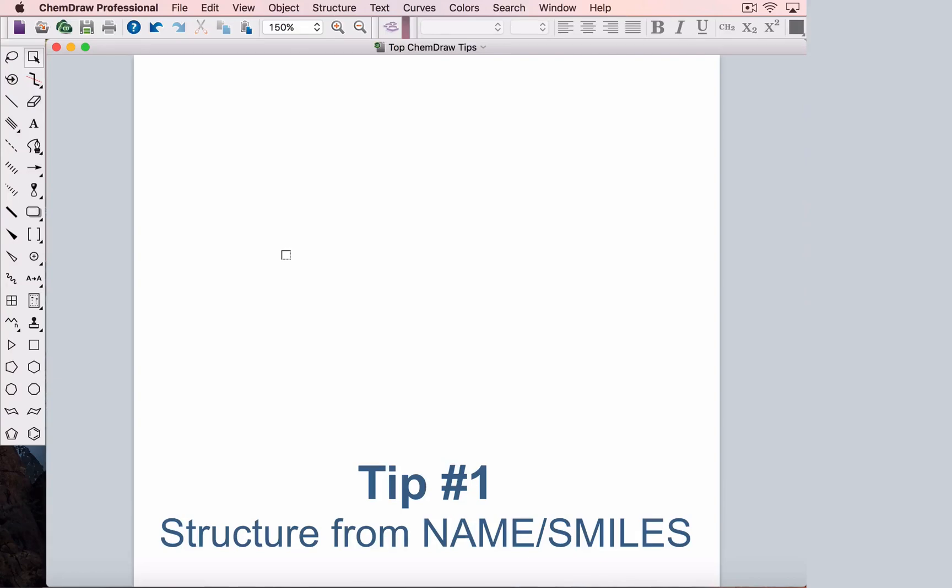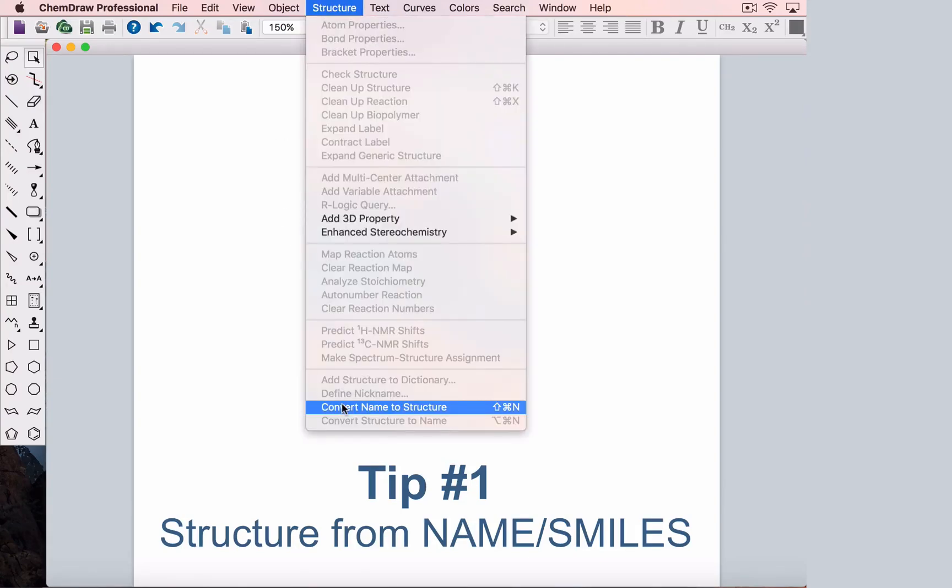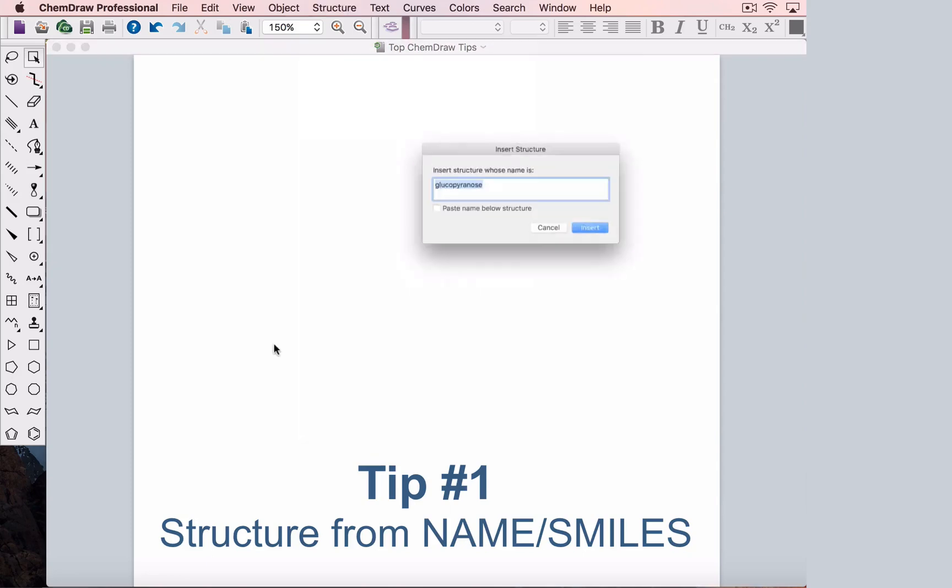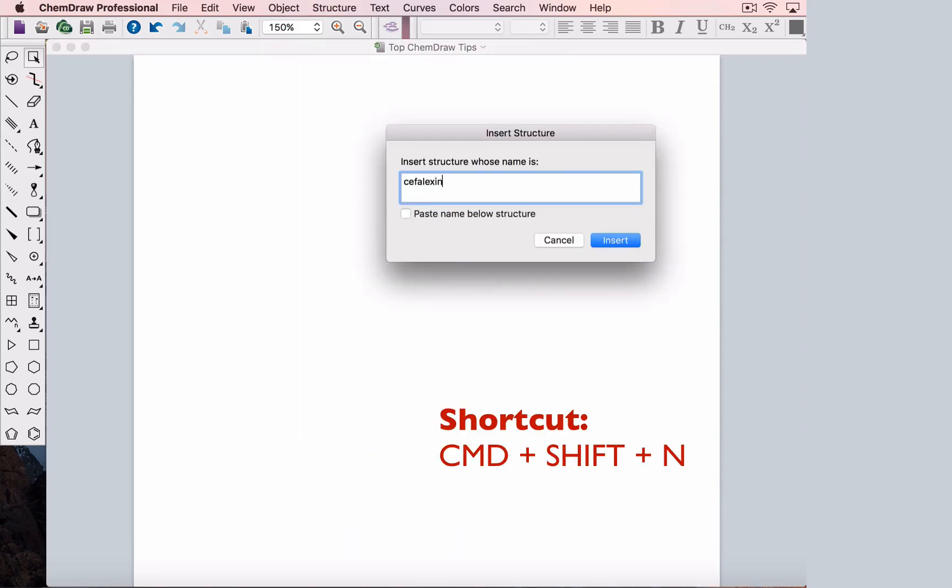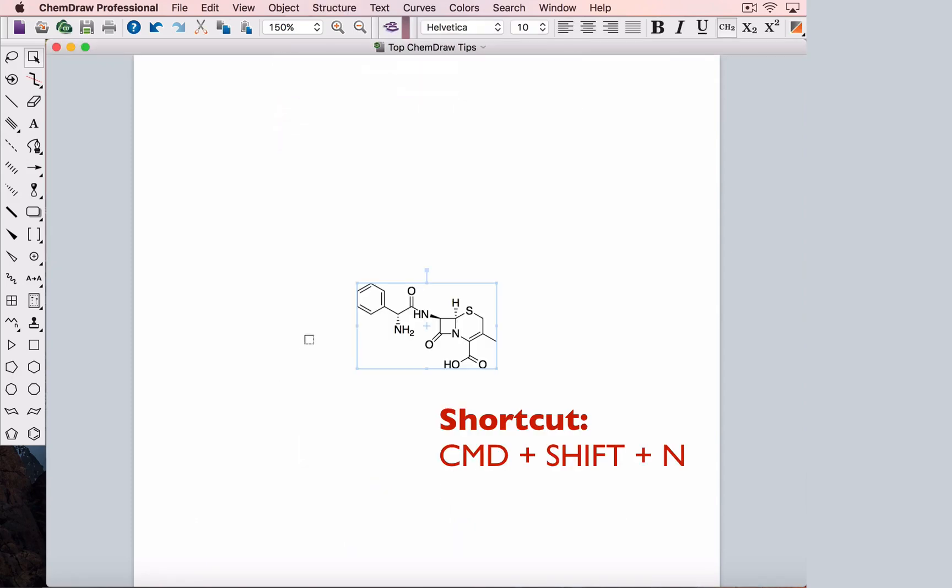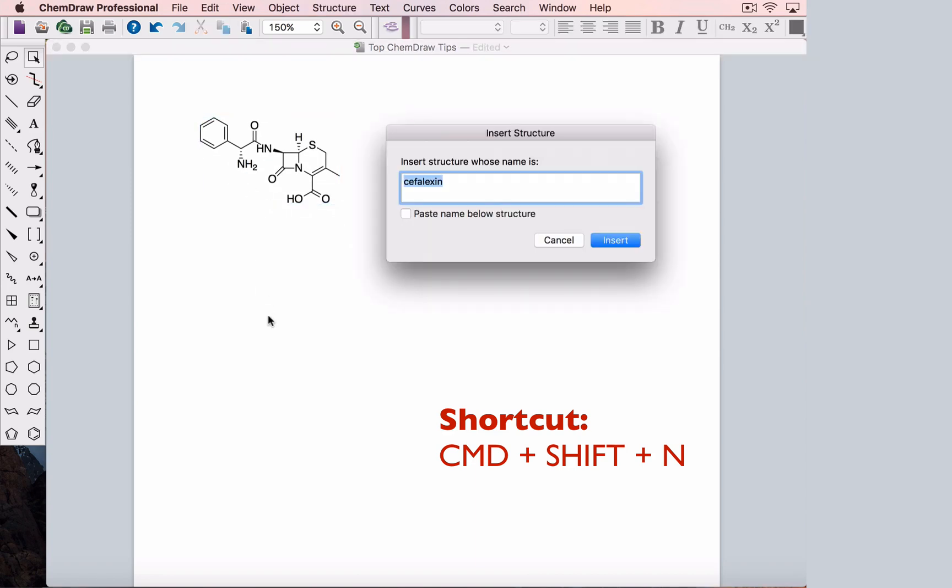You can generate structures quickly from their names. ChemDraw 16 is smarter than ever and able to generate the structures of drugs from both trade and generic names using a database. If you're TAing and want to write some quiz questions for students to identify functional groups on interesting molecules, this is a great way to do it.